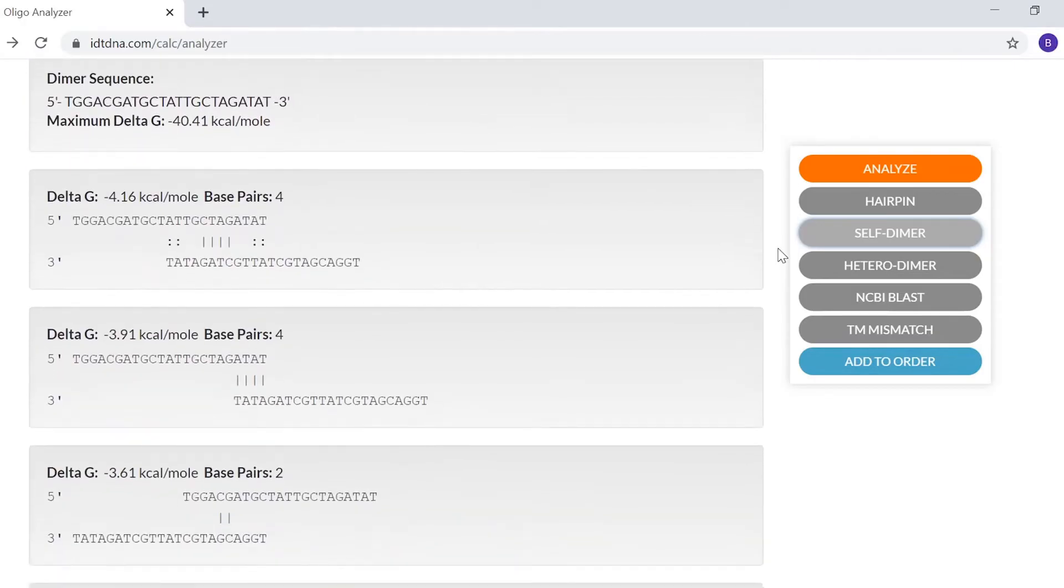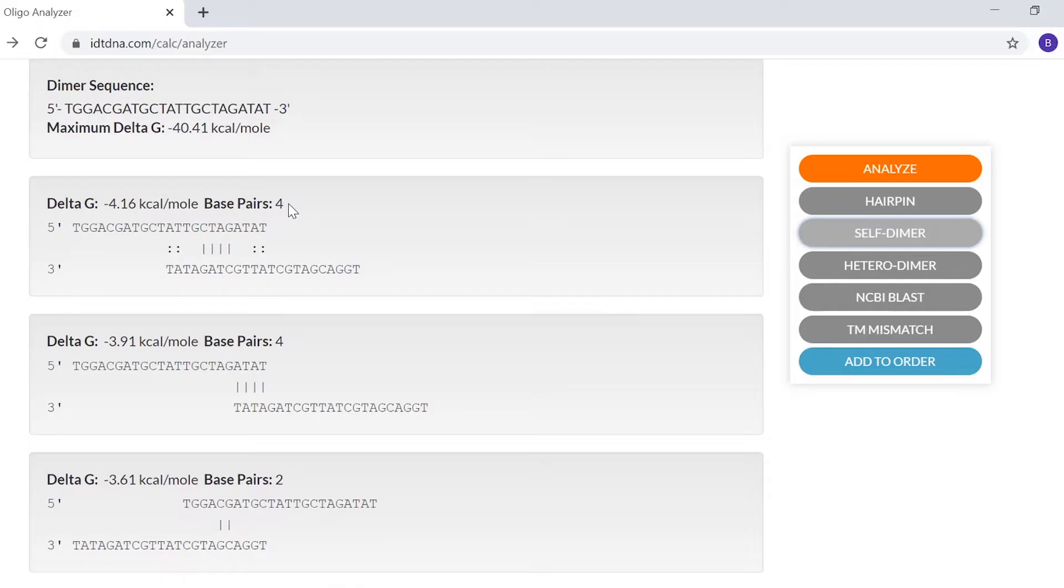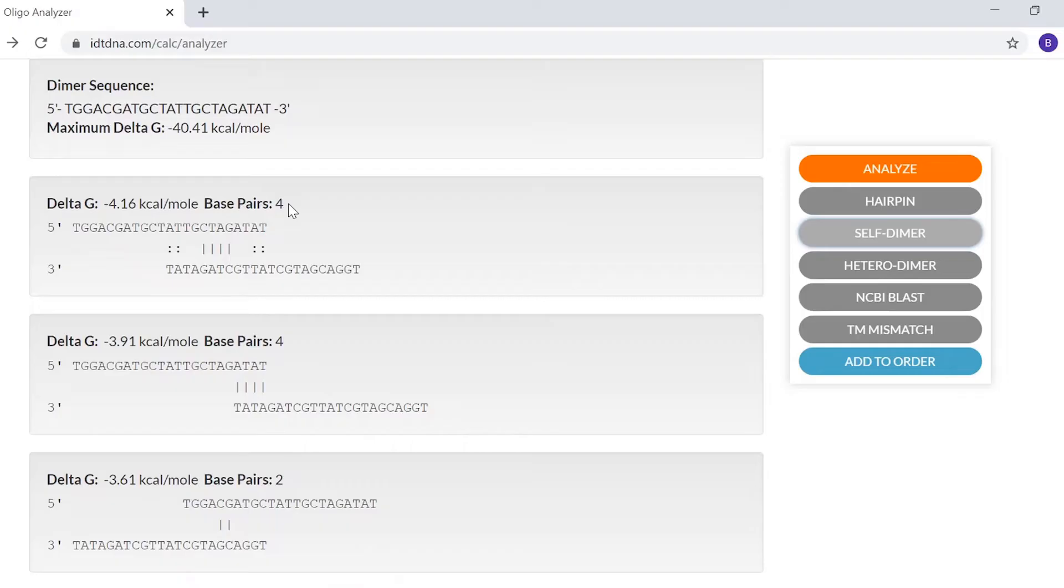Dimers are reported using Gibbs free energy, or delta G. The more negative the delta G value, the more stable the dimer structure. When designing primer length Oligos, you generally want the delta G for the dimer structure to be less negative than negative 9, as shown in the negative 4.16 delta G for this first structure. This is not an absolute requirement, but it can serve as a starting point.